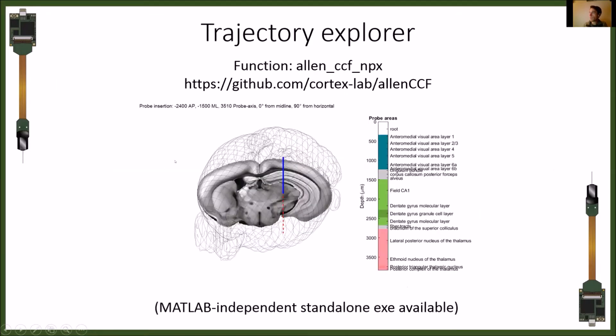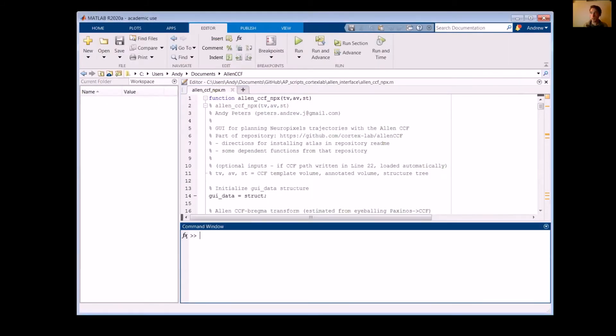On to how you would actually plan your trajectory. I'll show you this GUI that I've got. It's this function in part of this repository from our lab. This is the account on GitHub here, and this will be included when you download that. So the function is called Allen CCF NPX. I think that most of the course people have tried to download it. It doesn't seem like there's any problems. But if you have any problems, let me know, or let Nick know if he's the handler problem. This is just a screenshot that I'll show you in a second. A quick note, if you don't have MATLAB, then there is a standalone executable. But I have very rarely in my life met people who don't have MATLAB and are working in neuroscience. So it hasn't been troubleshooted yet. So if you need help with that, let me know. I'm just going to give you a practical demonstration now of how you would use this GUI. I'm just going to pull it up, and I'm going to show you what all the buttons do.